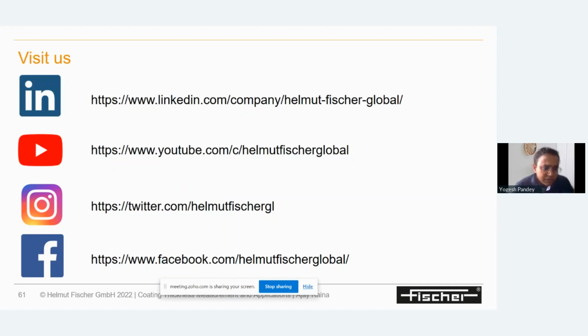Next is Mr. Pandian. His question is about zinc and zinc-iron plating on an iron base. Is that possible through an XRF machine? Yes, normally these applications are our regular applications that we can check with XRF instruments. Zinc and zinc-iron on a ferrous base can be easily checked.